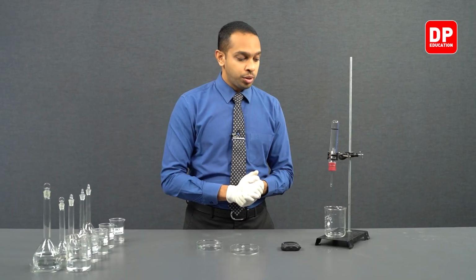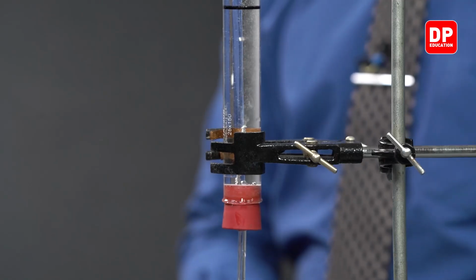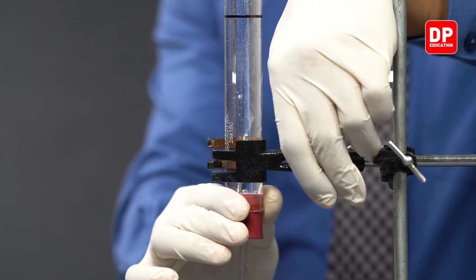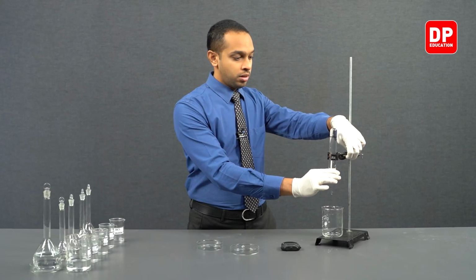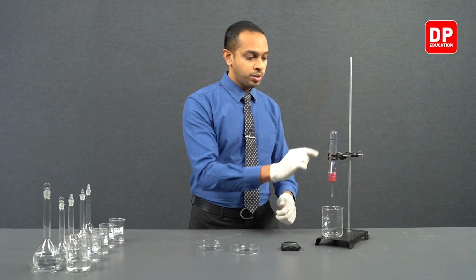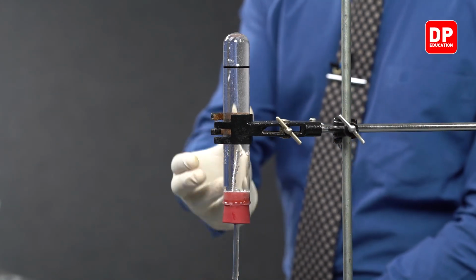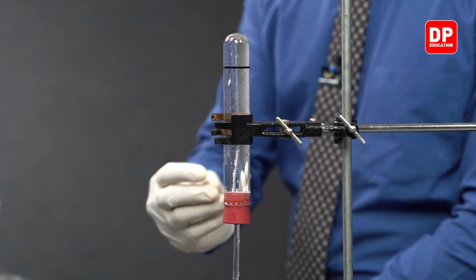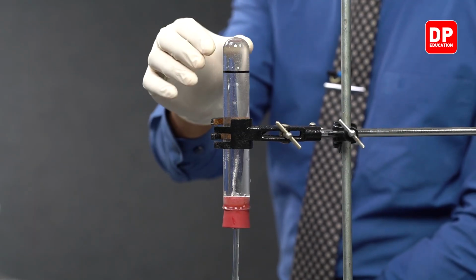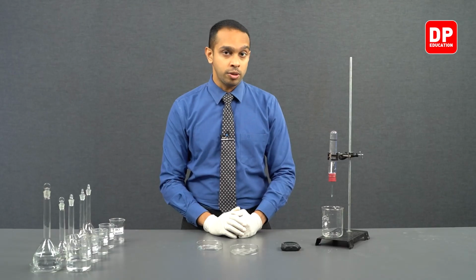Now, as you can see, students, the magnesium strip is reacting with the HCl, and you can observe the magnesium strip coming into contact with HCl and producing hydrogen gas. As the hydrogen gas gets collected over here, the water from that area gets displaced and comes out of this glass tube that we have connected to our rubber stopper.